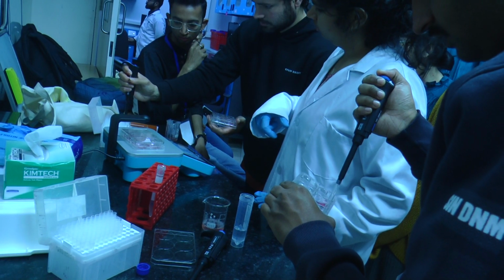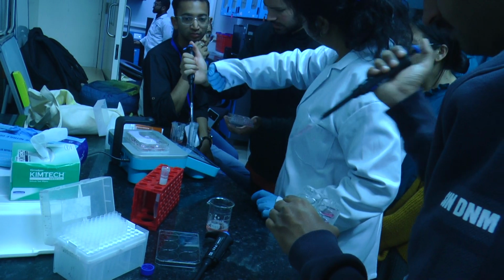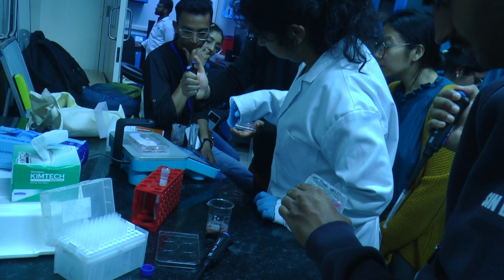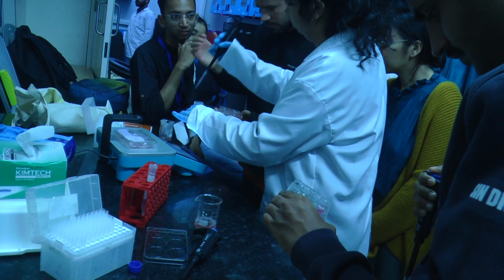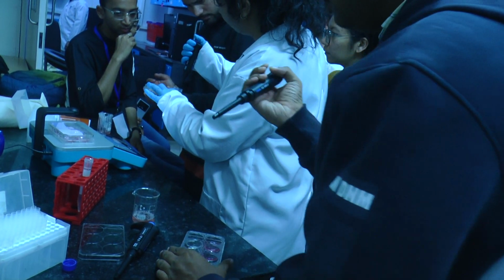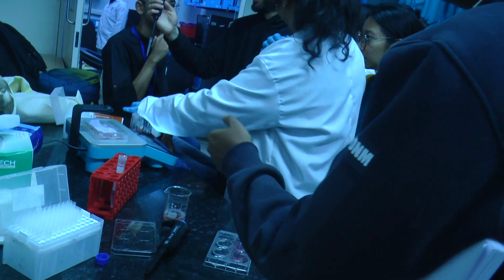It's budding. Have you seen GPMVs earlier, with the budding and all? Suppose this is one GPMV. In the image you can see the budding of some part of it, and it gets separated. So there's a cell, and some part of it will bud and get out, leaving the cytoskeleton.